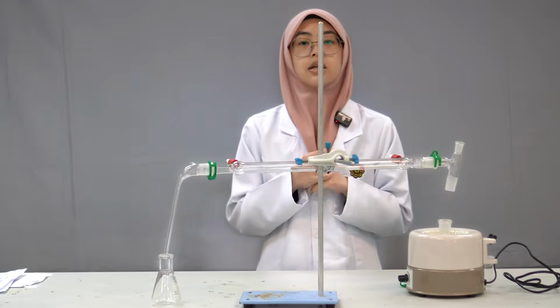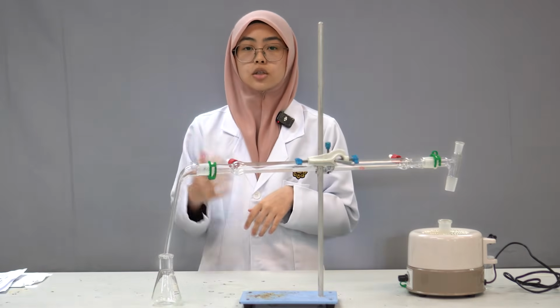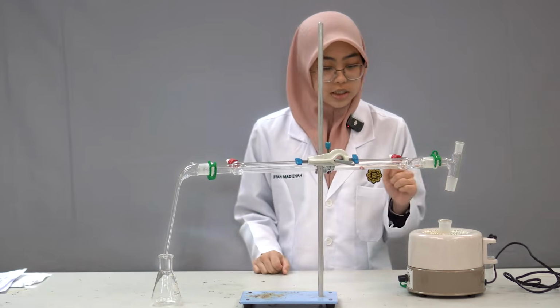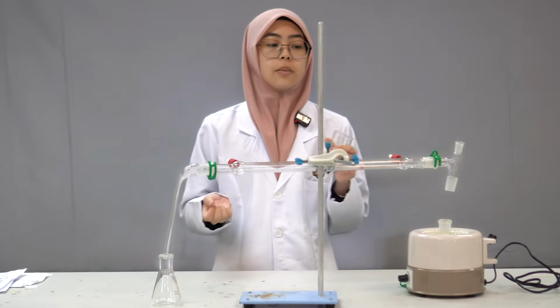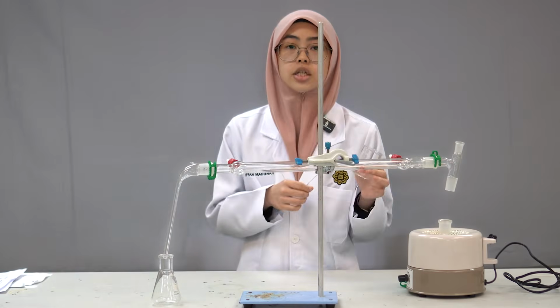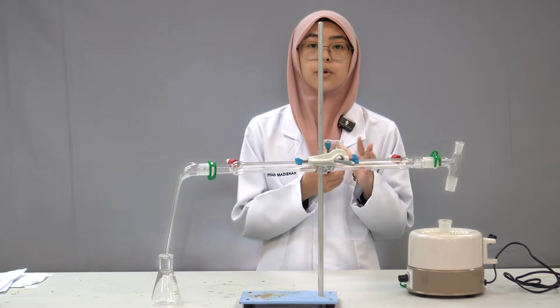Okay, next I'm going to present about the precautions during the experiment, but I will also recap the procedure that Akma explained before. So first things first. Before we do the distillation, we have the liquid extraction. So we need to add a bit of anhydrous sodium sulfate to remove the excess water. Okay, so this is the first precaution.